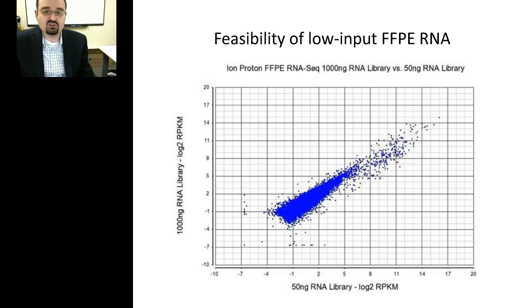such that sometimes we get very good tumors, shown in the upper left, with plenty of tumor cellularity. Sometimes we get tumors like on the upper right that are intertwined with a variety of stromal cells, or sometimes we get tumors like on the bottom here in the center, comprised mostly of stroma and scar tissue with very little tumor, and many times almost all samples are formalin-fixed paraffin-embedded, providing an extra challenge for the study of these samples using next-gen sequencing.